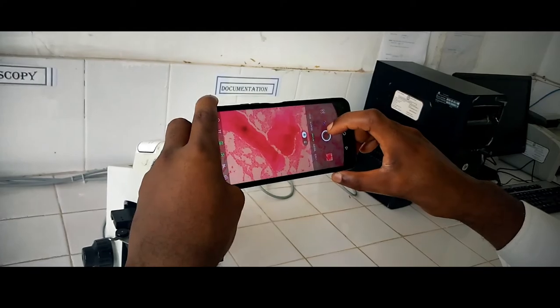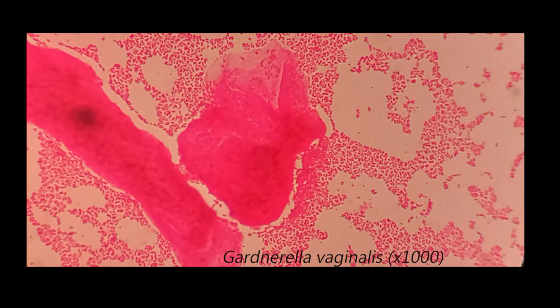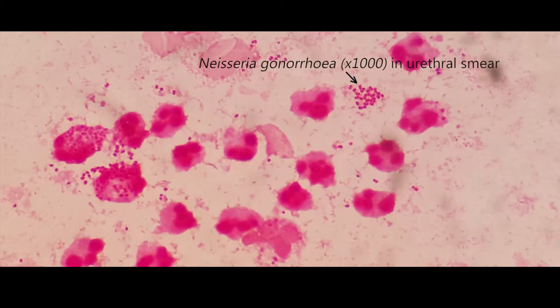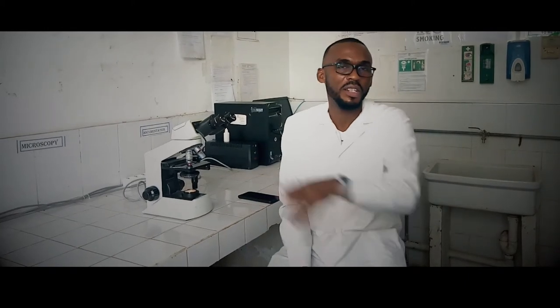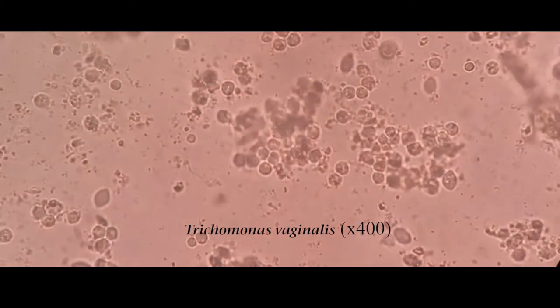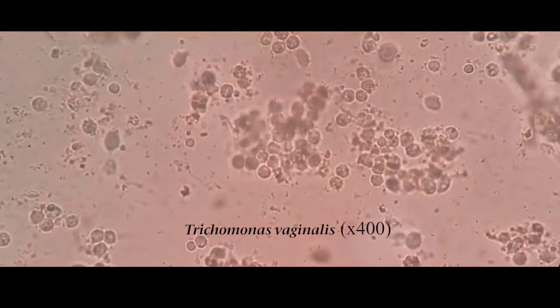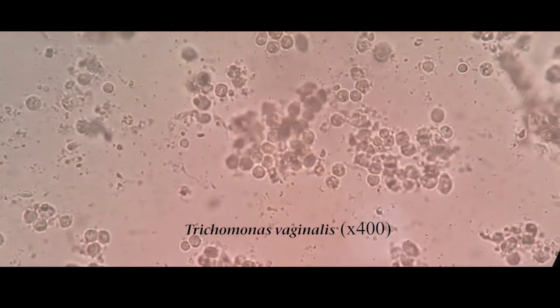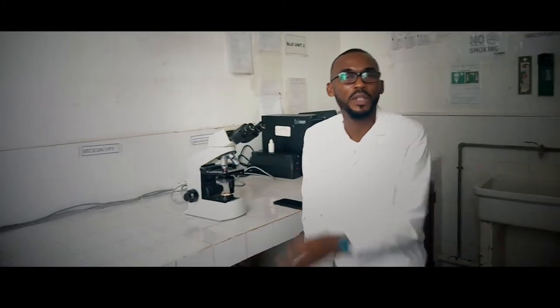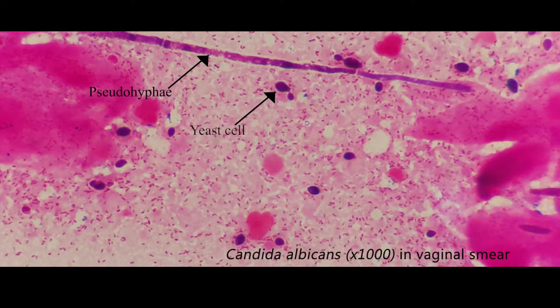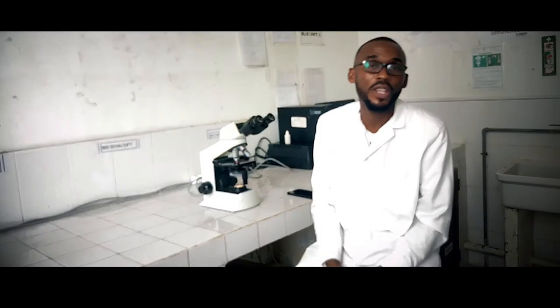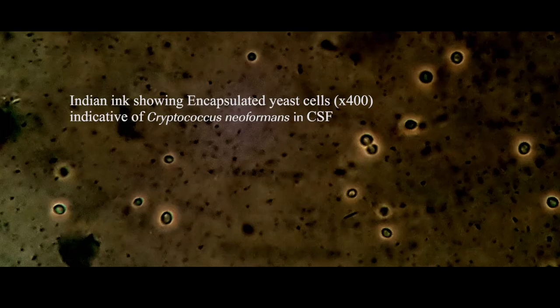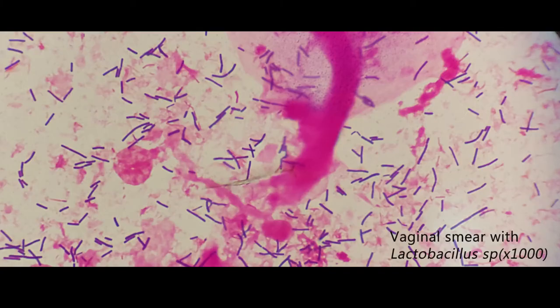I just took a snapshot of that. We have other samples that we have viewed in this same sense and I will be showing you pictures of some. We've had Neisseria gonorrhoeae that you see on your screen, and we've had Trichomonas vaginalis. This time around, we took a video to prove that Trichomonas vaginalis is motile — those are the moving cells you can see. We've also had cases where we observed Candida albicans and snapped the pseudohyphae and the germ tubes. It's out here for you to make use of this method and get your pictures right for your projects, your theses, and all that.